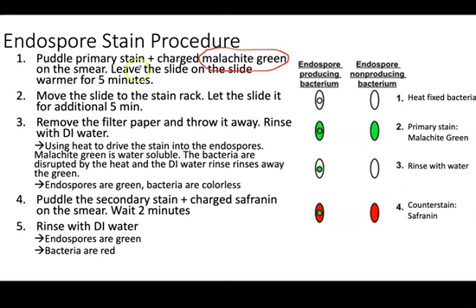So same method as before, a long exposure time, so 5 minutes plus another 5 minutes, so it's 10 minutes in total. And during the first 5 minutes, we have heat being applied. So we're really trying to force that first dye into that endospore. So if you look at this schematic, these are two different bacteria, what they're supposed to represent.